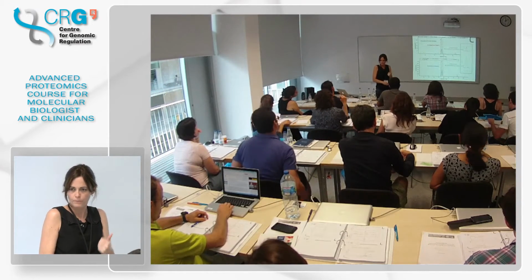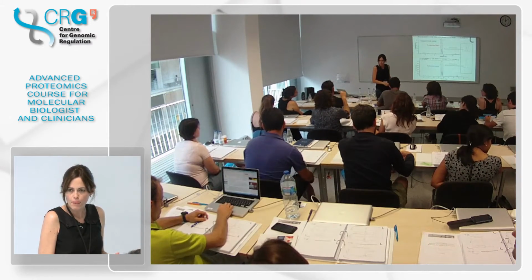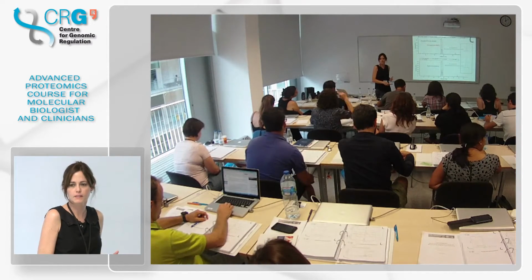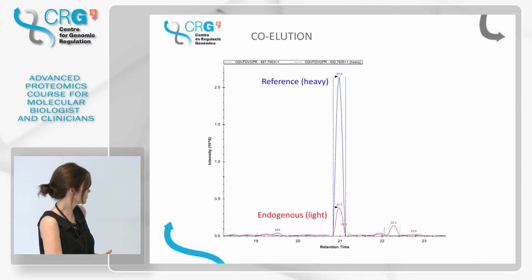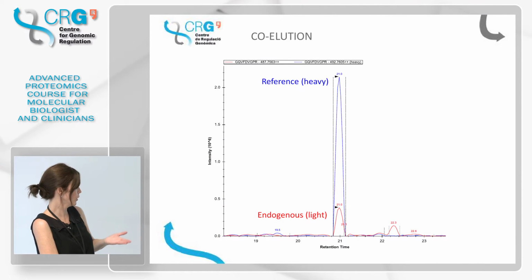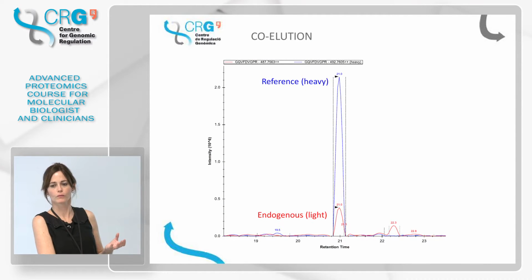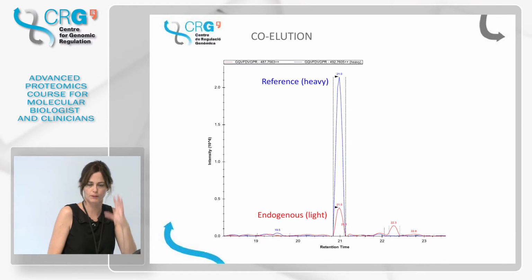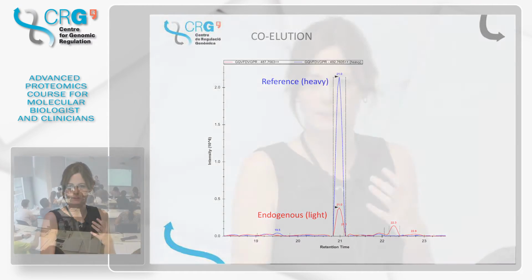So this is the height of each peak. Yes. It's not linear, it's the height. Yes. Okay, and when we look at this, we are not looking at one individual transition, but at the sum of all of them. It's just another way of looking, but sometimes people get confused with this. That's why I wanted to tell you this before the afternoon, before you are in front of the screen and you don't know what you're looking at.